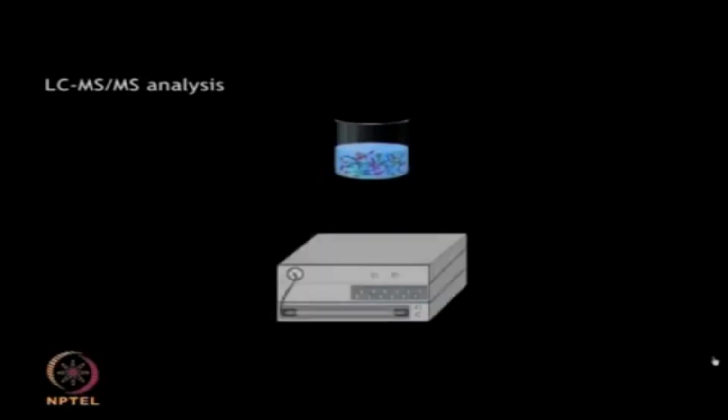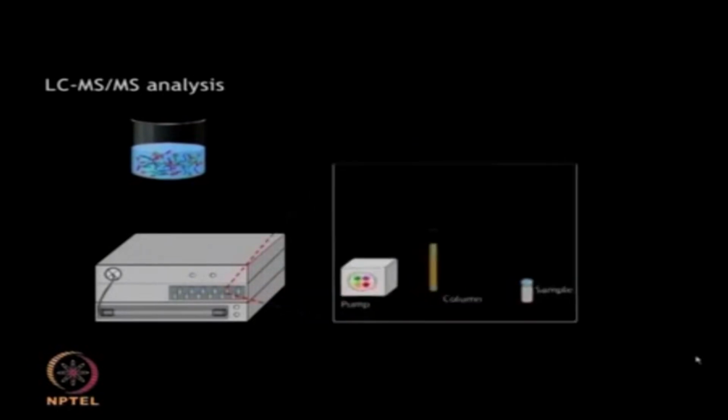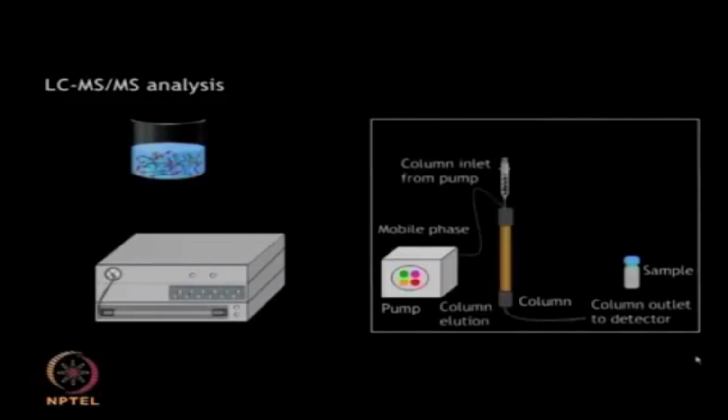Further purification of the strong cation exchange purified samples is carried out by reverse phase liquid chromatography, wherein the sample is passed through a column containing a packed stationary phase matrix that selectively adsorbs only certain analyte samples. The eluted fractions are further characterized by MS.